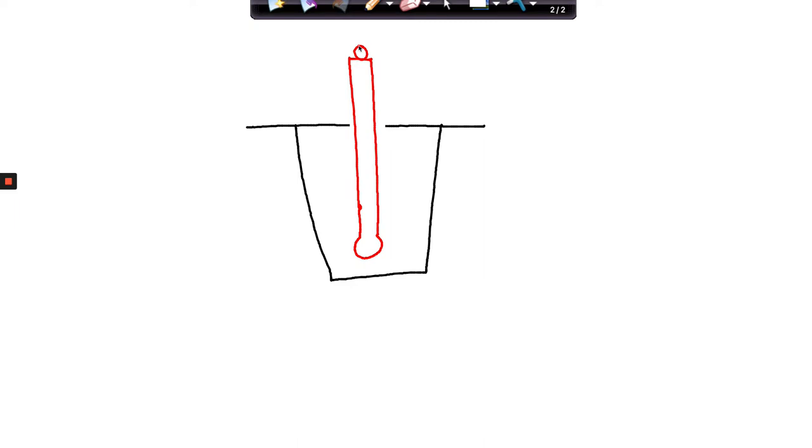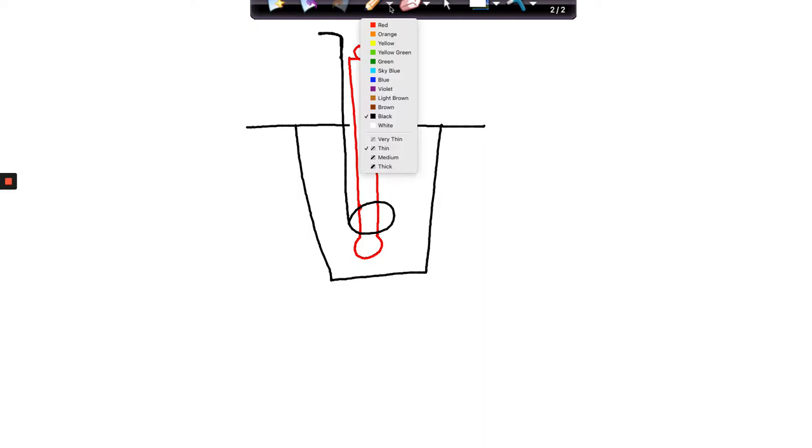Then, guys, around this, we are then going to place a nichrome wire. Like so. And guys, by the way, when you build this in lab, you're going to find it's easier if you take the top of your nichrome wire and throw a 90-degree bend in it. Then it gives you something to hold on to while you jiggle. Then guys, what you need to do from here is you got to add some water.